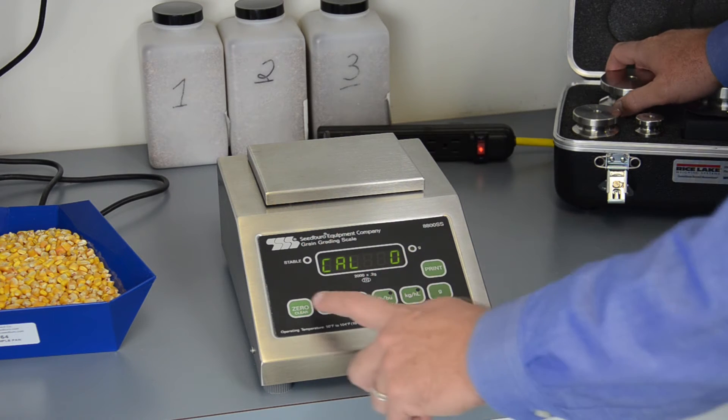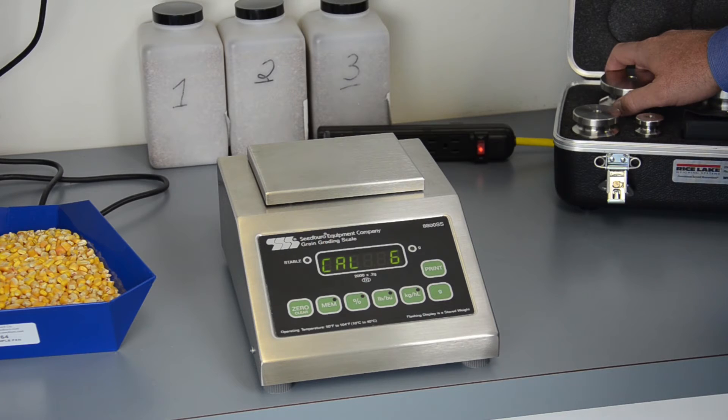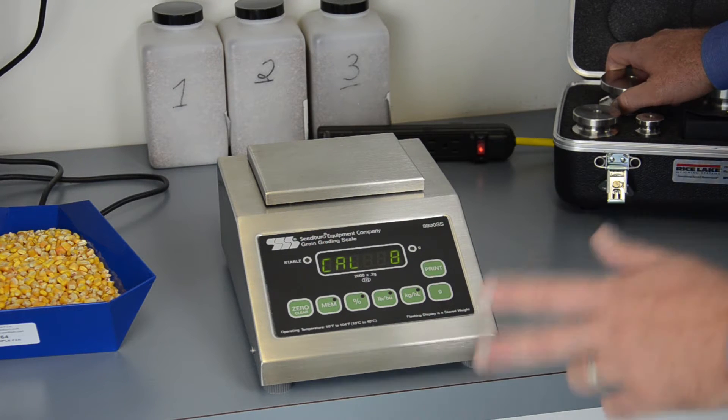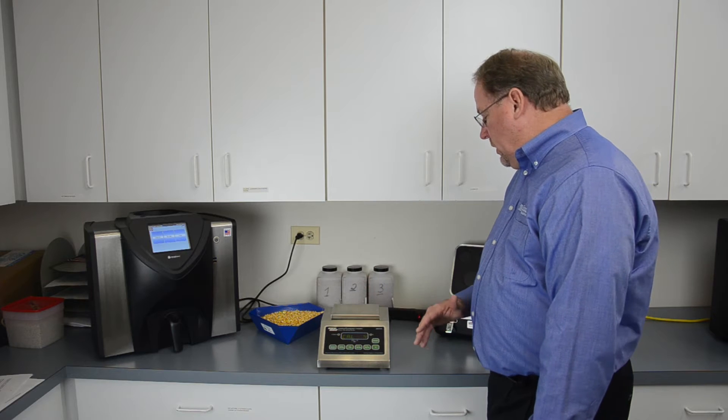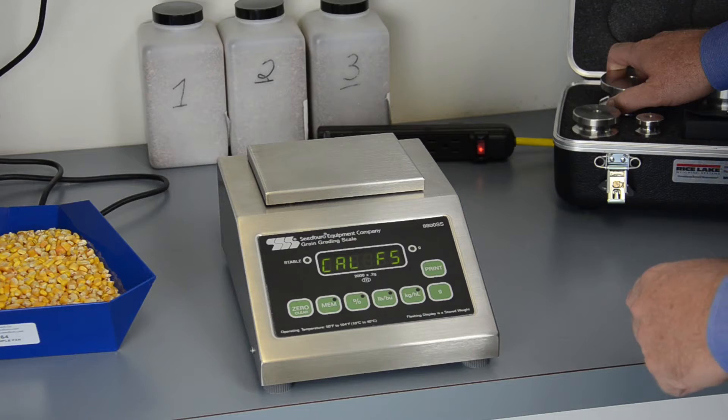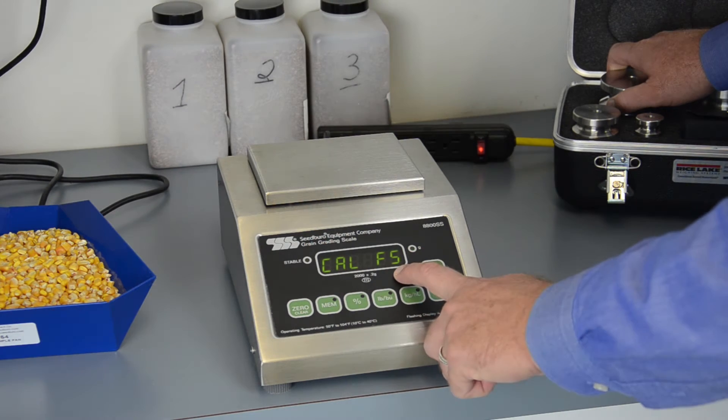It's asking for zero weight, which we have with the scale clear. We push the zero button. It will count down from eight to zero twice, and then it will automatically go to calibrate full scale.